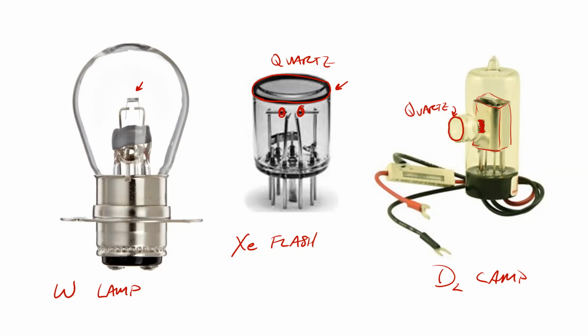Just neat to see those. We will see this guy and this guy when we take apart a UV-Vis. I'm not taking apart the brand new one, so we won't see the xenon flash bulb until the one we have runs out and I get to keep the dead one.